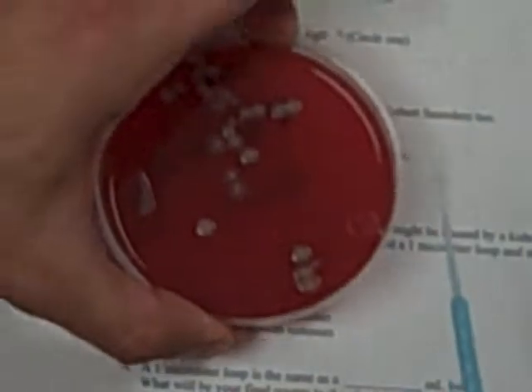So I say, hey, you streaked this out with a 1 microliter loop, and you're therefore going to say, okay, for each one that grew on my plate, that's representative of 1,000 colony forming units per milliliter. So if there are 44 total, then that's 44,000 colony forming units of this enteric gram-negative rod, which is what grows up looking like a large gray mucoid colony.